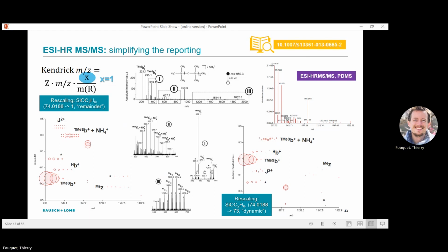Doing that, it's so extreme, you're expanding so much along the y-axis that the points line up more horizontally. It visually improves the point alignment along the x-axis.